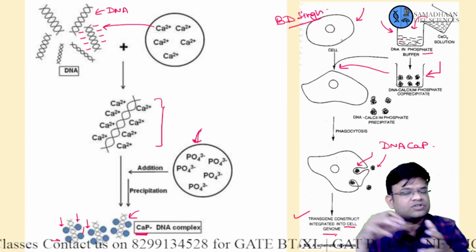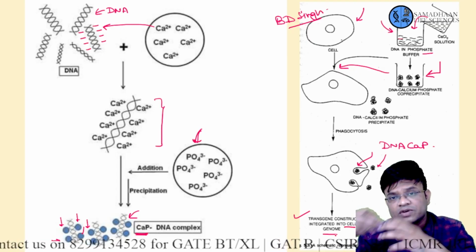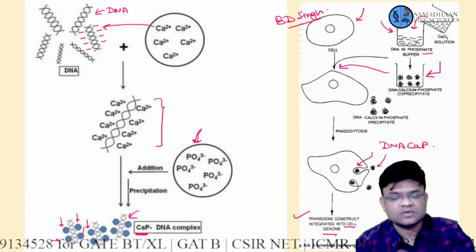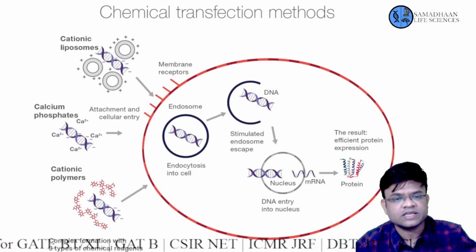That means the original DNA of the cell, the gene that you have entered, or the DNA that you have transfected, will go and integrate inside the genome of the cell. This is what is being said over here. So the diagram is basically representing almost the same thing.